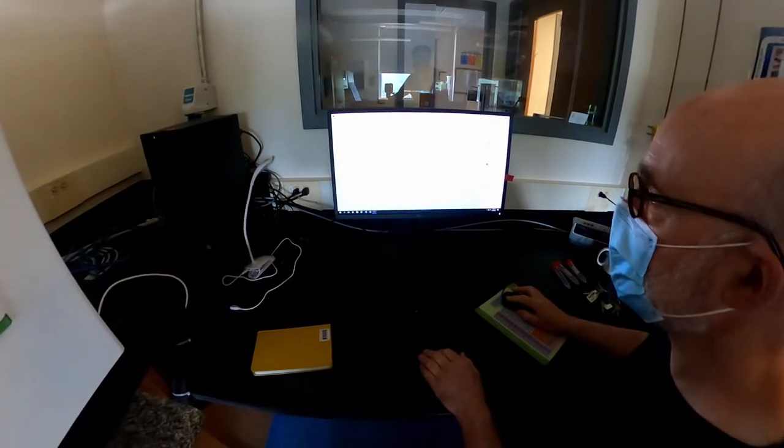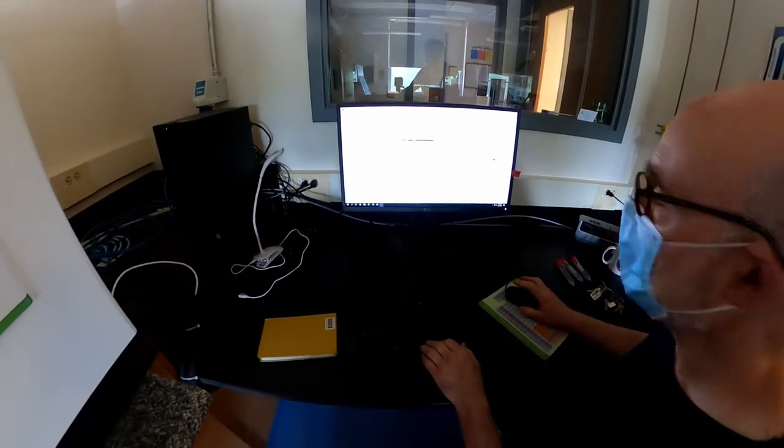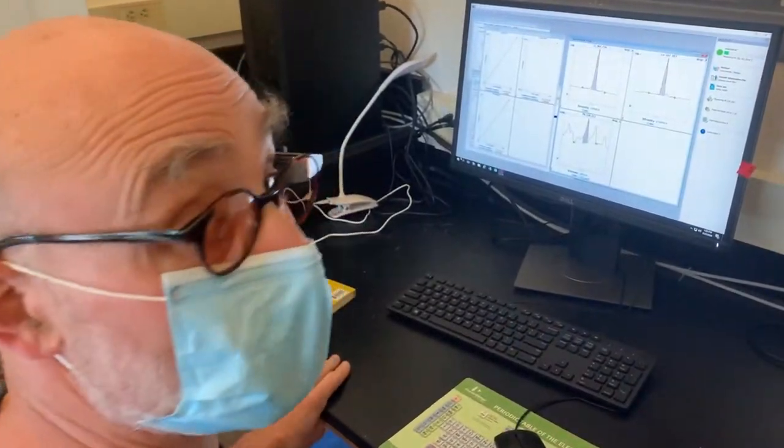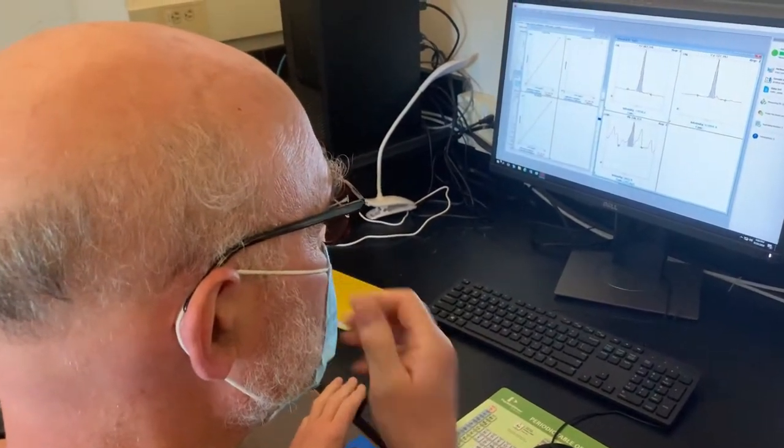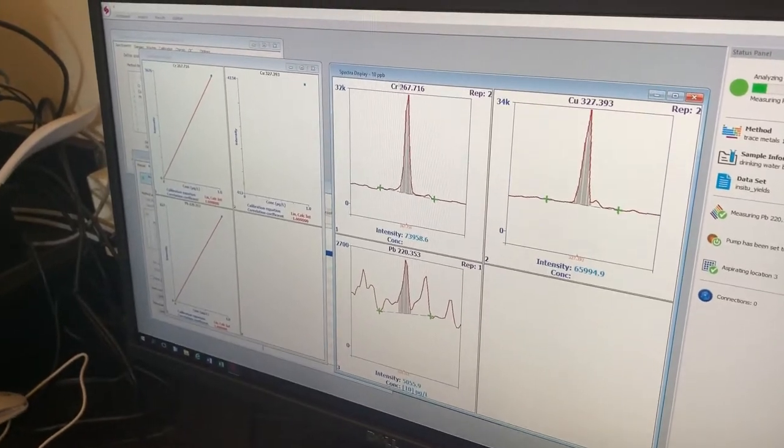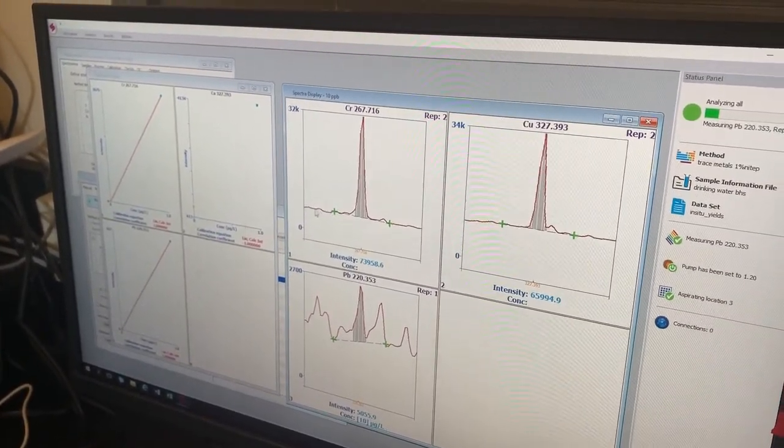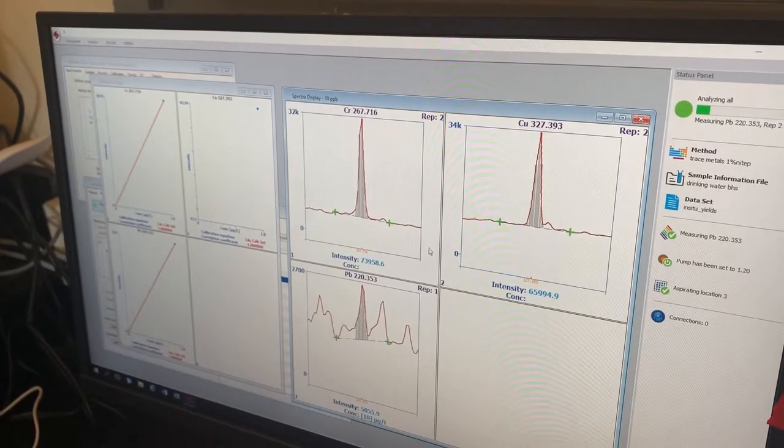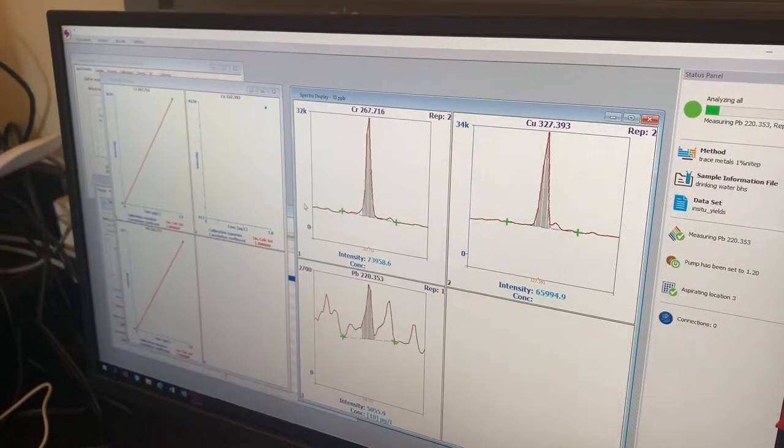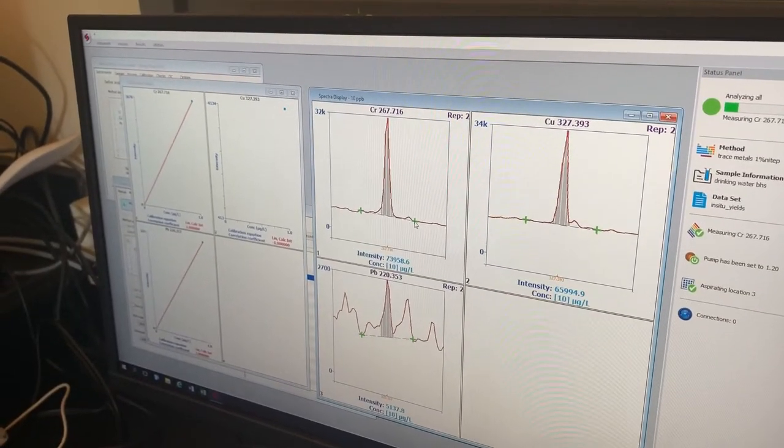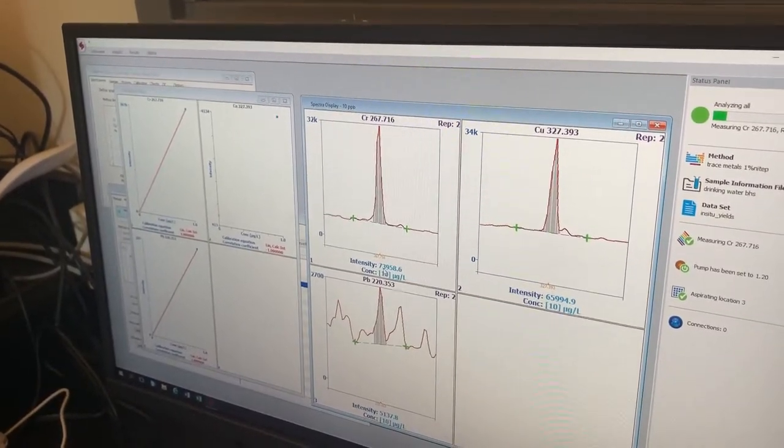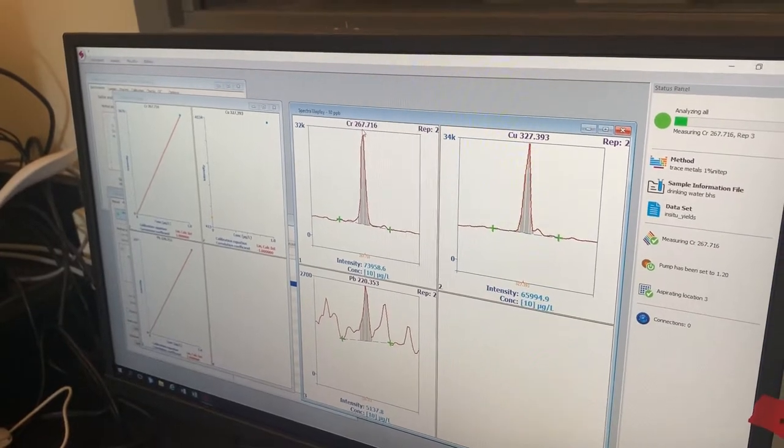I'm going to go to analyze all and we'll see what happens. This is the first time our machine has run since March. Okay. So we're making analyses now and these are on standards. And this is the 10 part per billion standard. So that's not very much. And we can see the peak for chromium here on the X axis here is wavelength. And on the Y axis is the number of counts again, intensity. And we have some background points that we're going to subtract here. And there's the chrome peak.